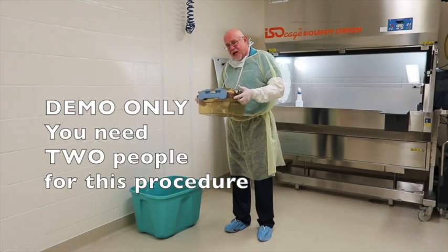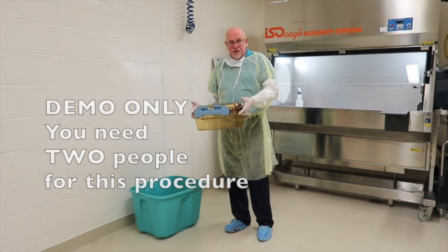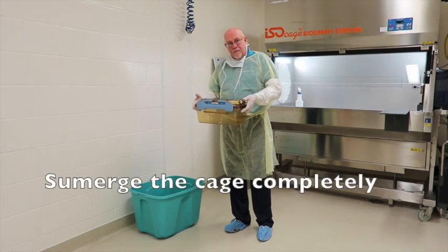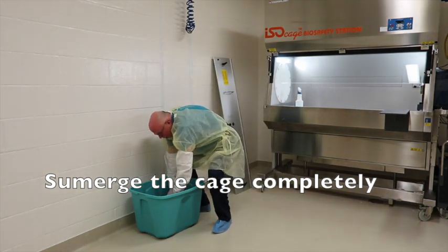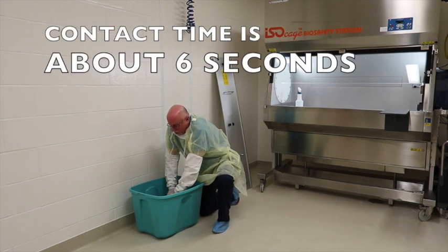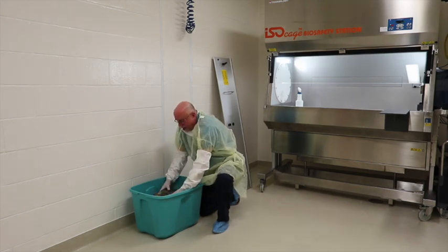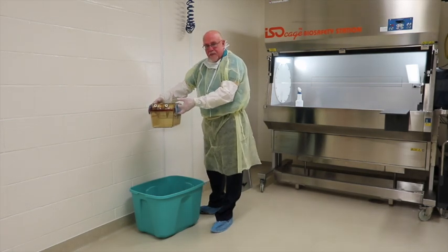I have a container with a sufficient amount of sterilizing solution so that when I insert the cage, I can completely submerge it for the required contact time. I take the cage, insert it, and press it all the way down where it's completely submerged in the solution. Typically this was done under the IBS where it was roughly about six seconds of contact time. The cage is then brought out and is now sterile and ready to go over to the IBS.